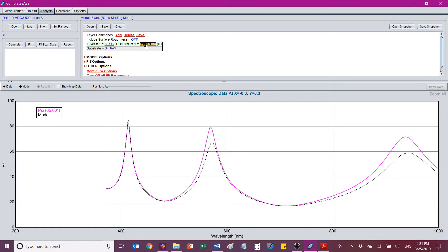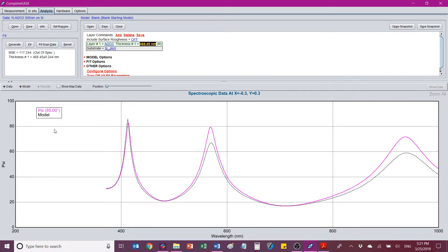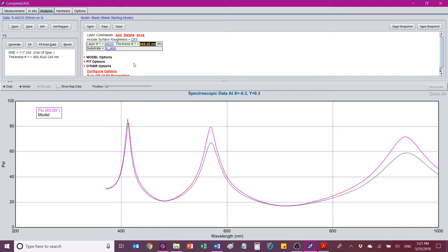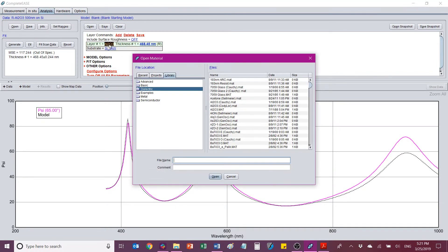And if I just right click this, I can toggle this little fit symbol back and forth. So now it's going to be fit. If I just hit fit, it will try and fit this data. And it really can't get it to match. So in order to deal with this, I'm going to replace this file with something that has parameters.